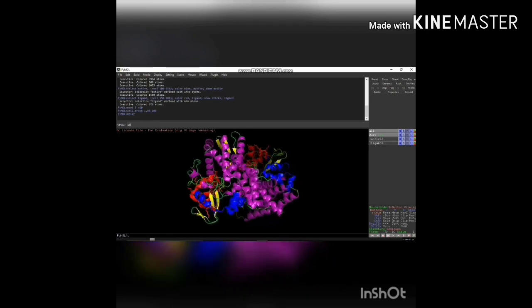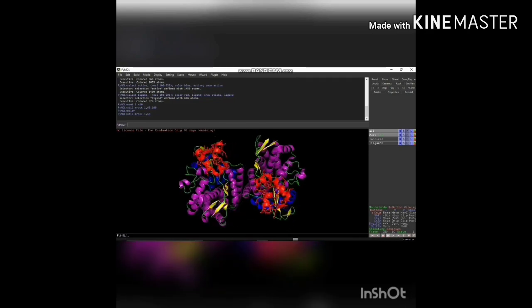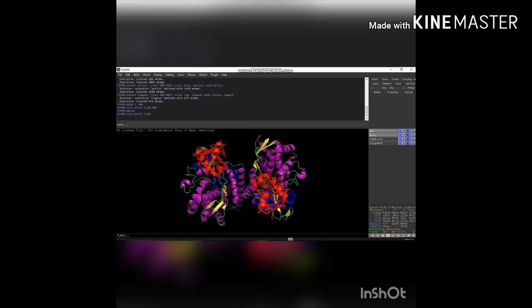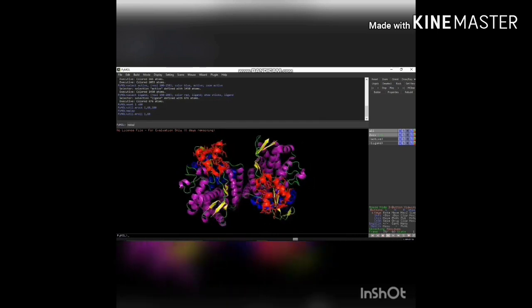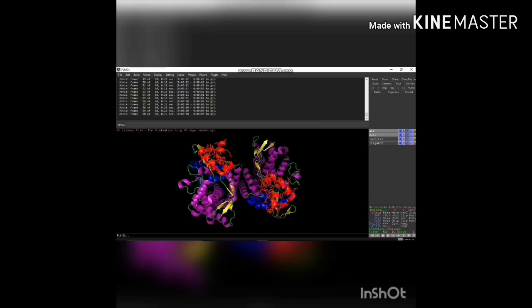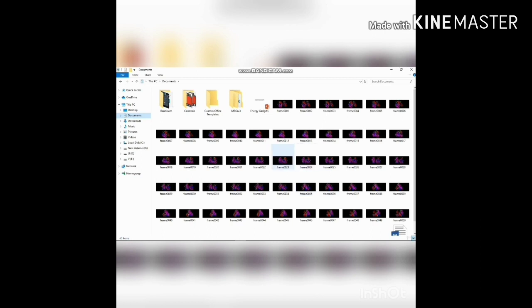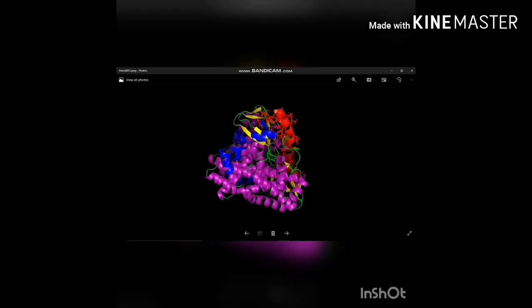Then give the command: util.mroll 1, 60 — this command rotates the protein molecule 360 degrees over 60 frames. Then give the command: mstop — the animation will be automatically stopped. Then give the command: mpng frame — it will create PNG files for each of the 60 frames, so you can view the protein molecule across all 60 frames separately and clearly.